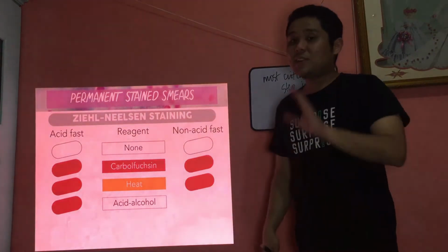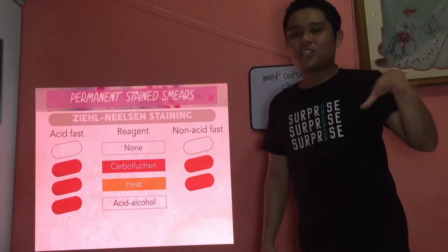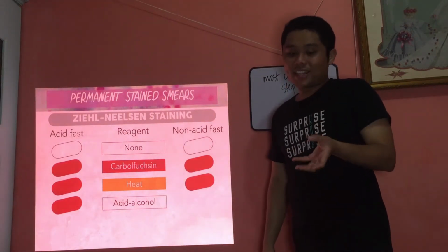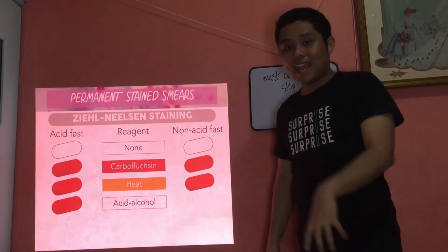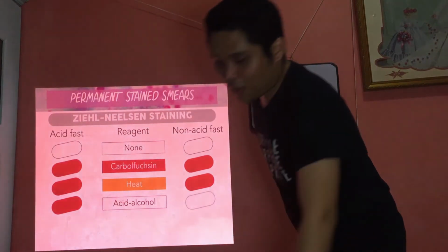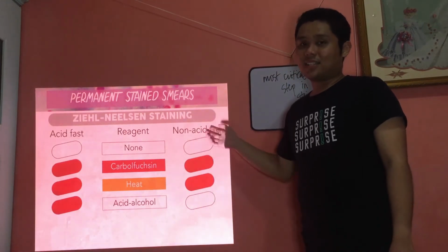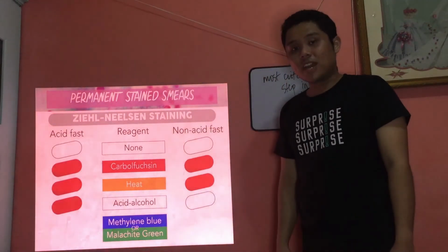Whereas, for the non-acid fast, because again, weak ang relationship, the long-chain fatty acids are not really there, no? So, dali na siyang ma-trigger, dali na siyang ma-tempt by the challenger, which is your decolorizer. So, pag-add sa decolorizer, dili siya ka-retain much. It cannot retain the carbofuchsin because it has a weak relationship. Therefore, pag-add sa decolorizer, the carbofuchsin will be washed out. Therefore, it will be colorless na ang non-acid fast. Okay? And pag-add na sa secondary stain, either methylene blue or malachite green, depending.